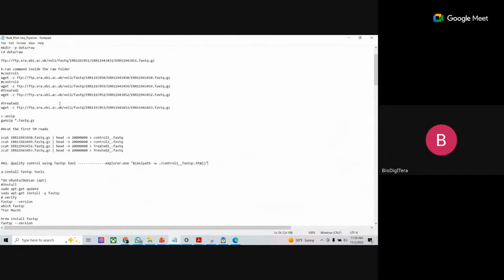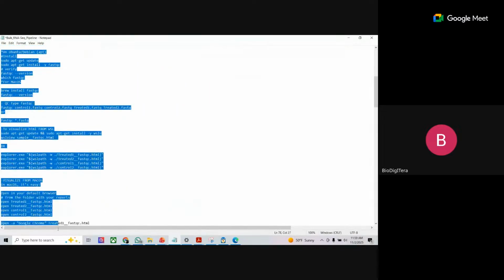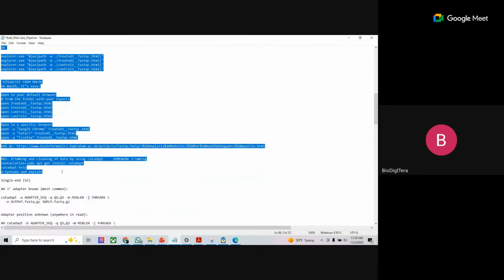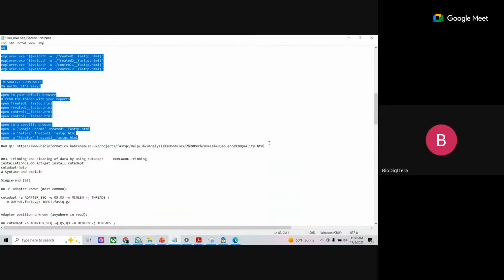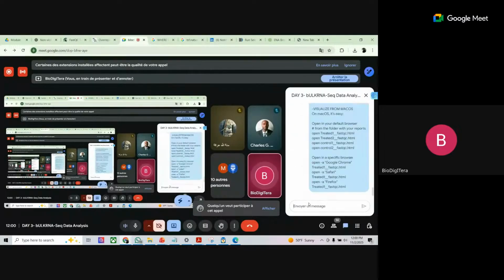Okay, guys, let me share what we have done till now with you. Visualizing. Okay, I share with you till here. You can copy this.